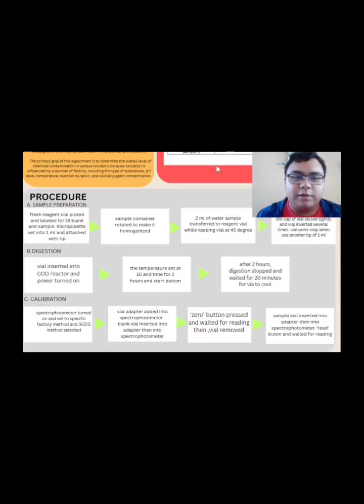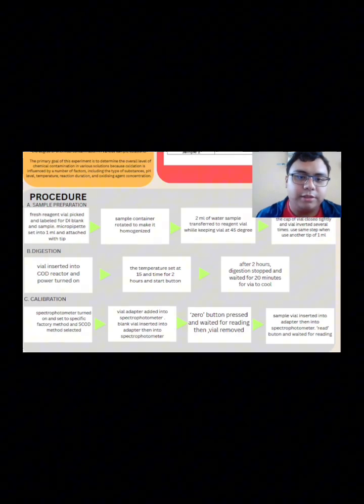Assalamualaikum, my name is Akmal Denibri Muhammad and I will be presenting about the procedure. There are three parts of today's procedure: sample preparation, digestion, and calibration.